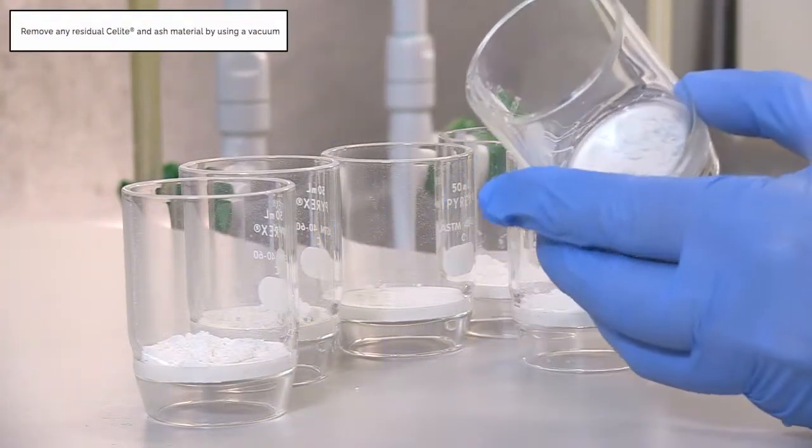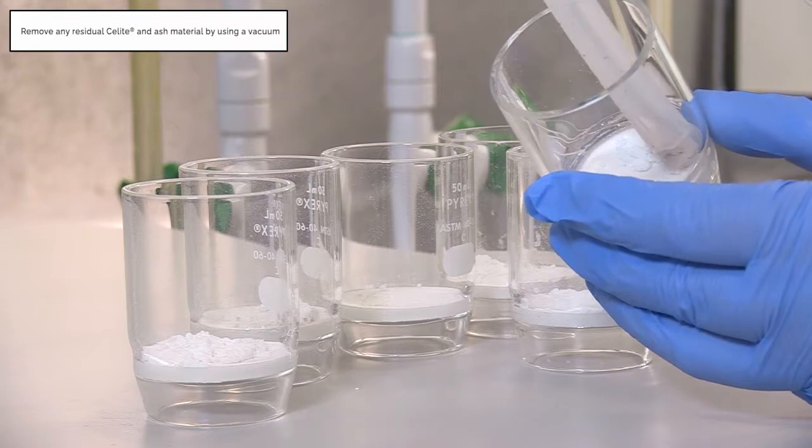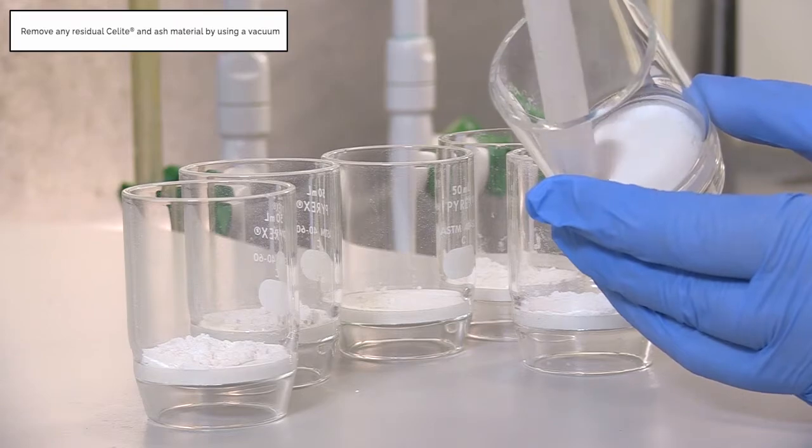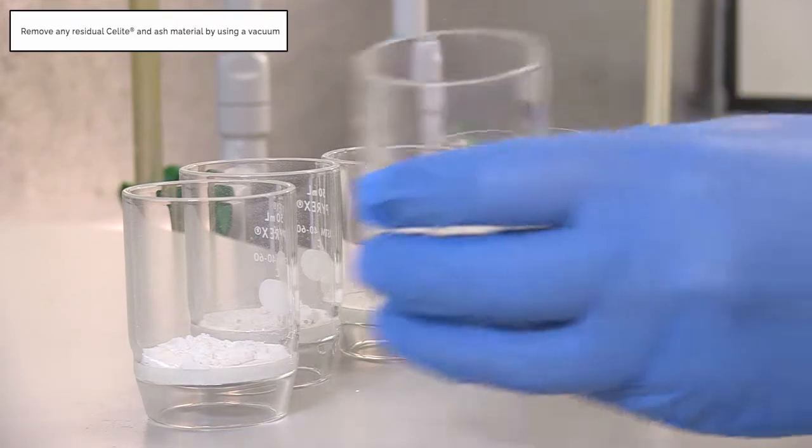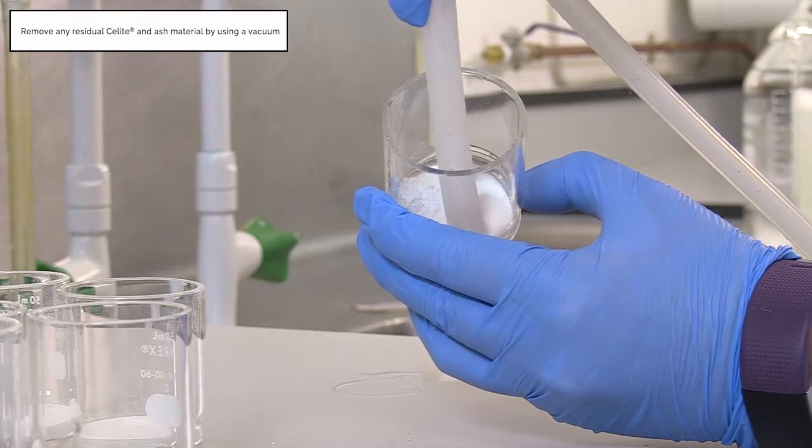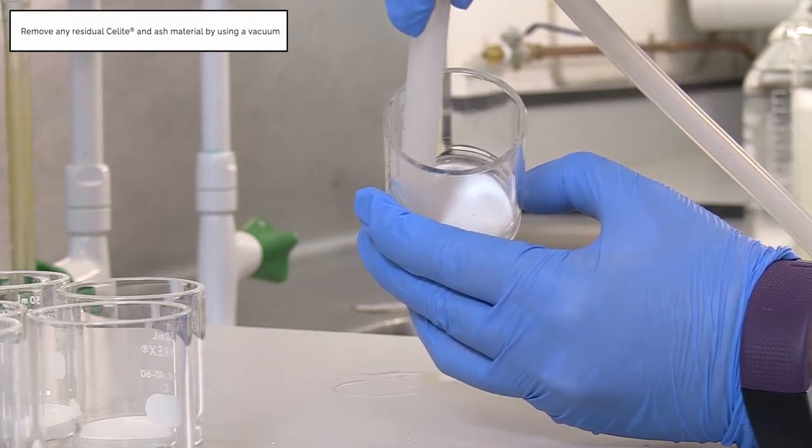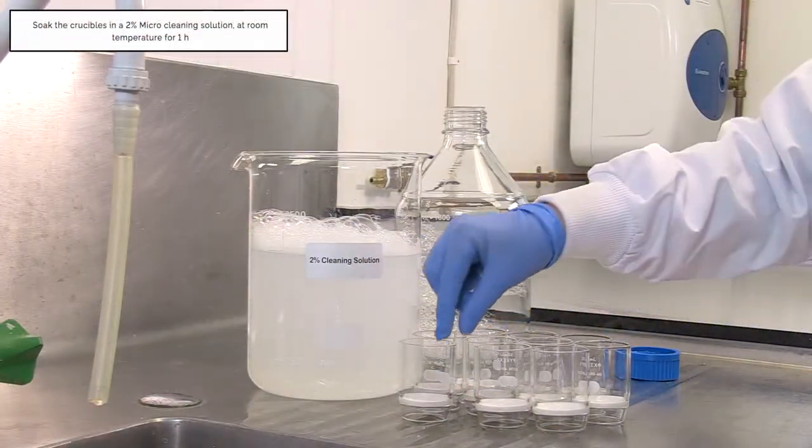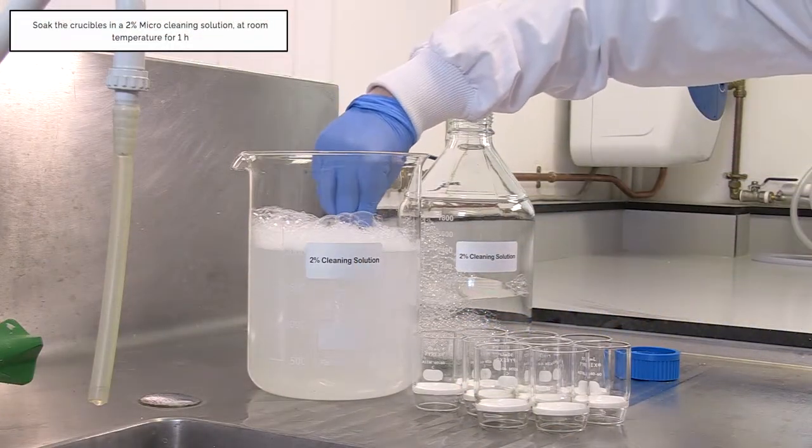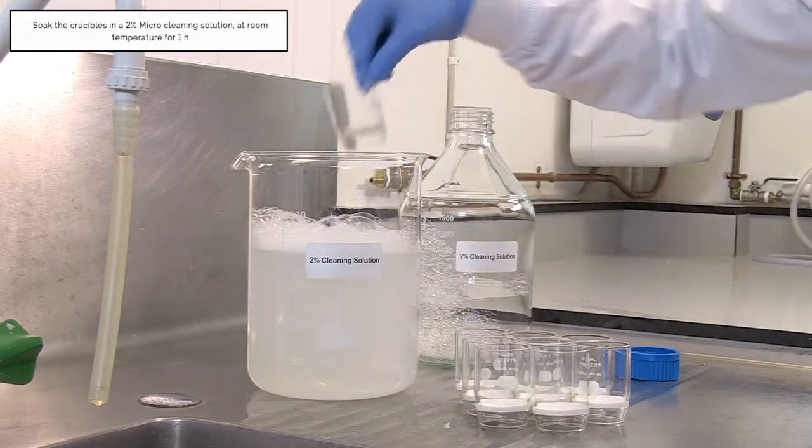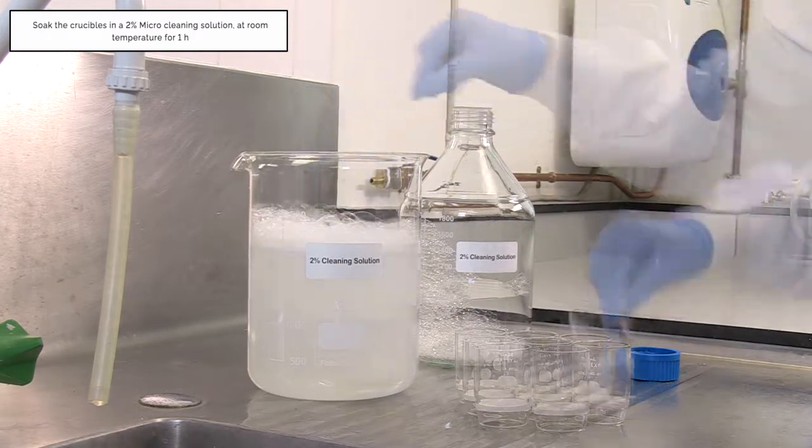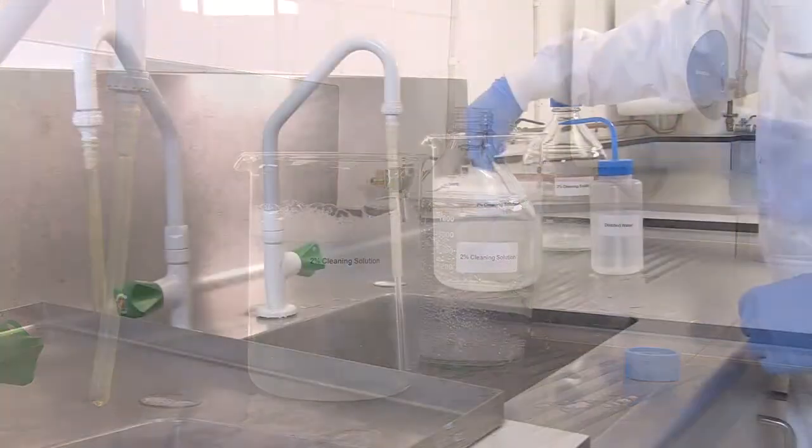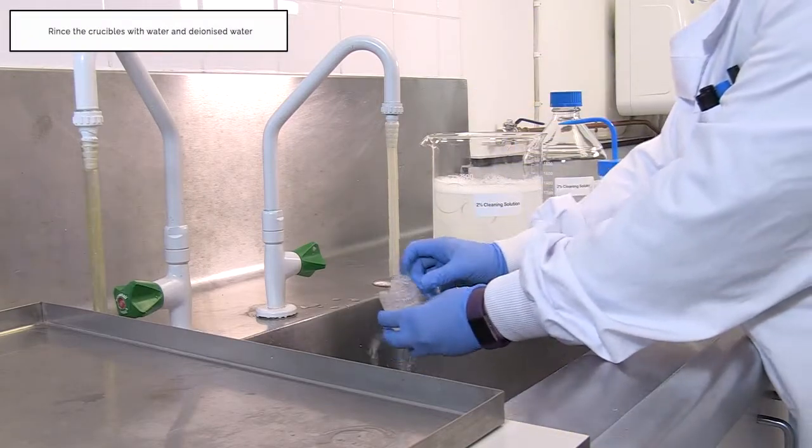Remove any residual celite and ash material by using a vacuum. Soak the crucibles in a 2% micro cleaning solution at room temperature for one hour. Rinse crucibles with water and deionized water.